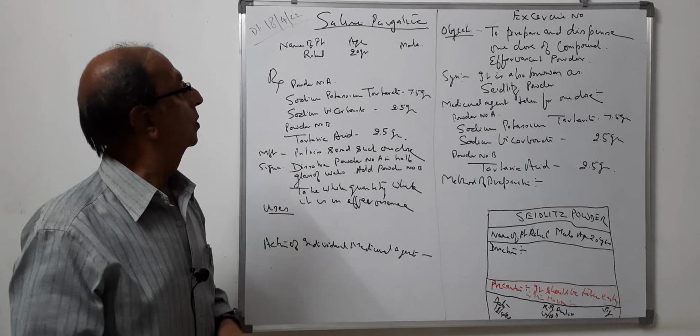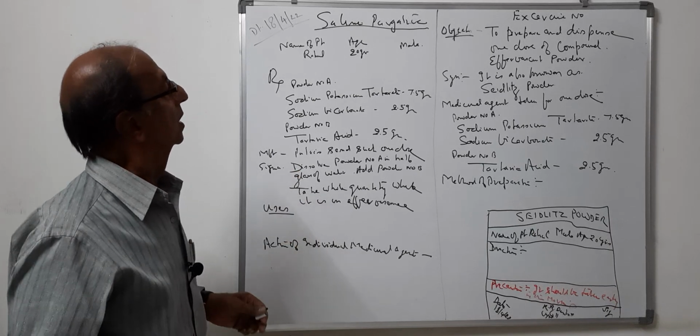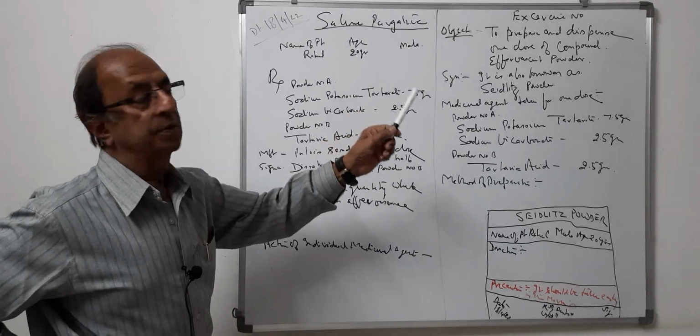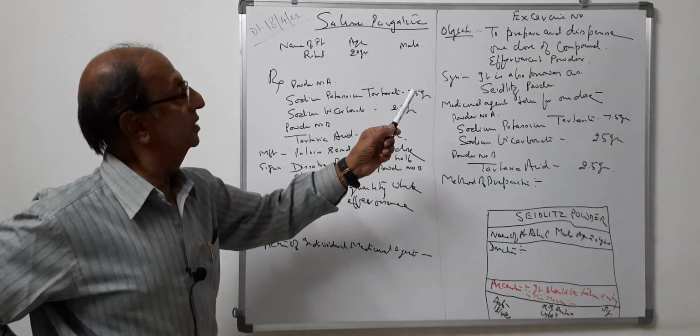Then about the name of this preparation, Seidlitz powder. This is a compound effervescent powder. This is also known as Seidlitz powder.